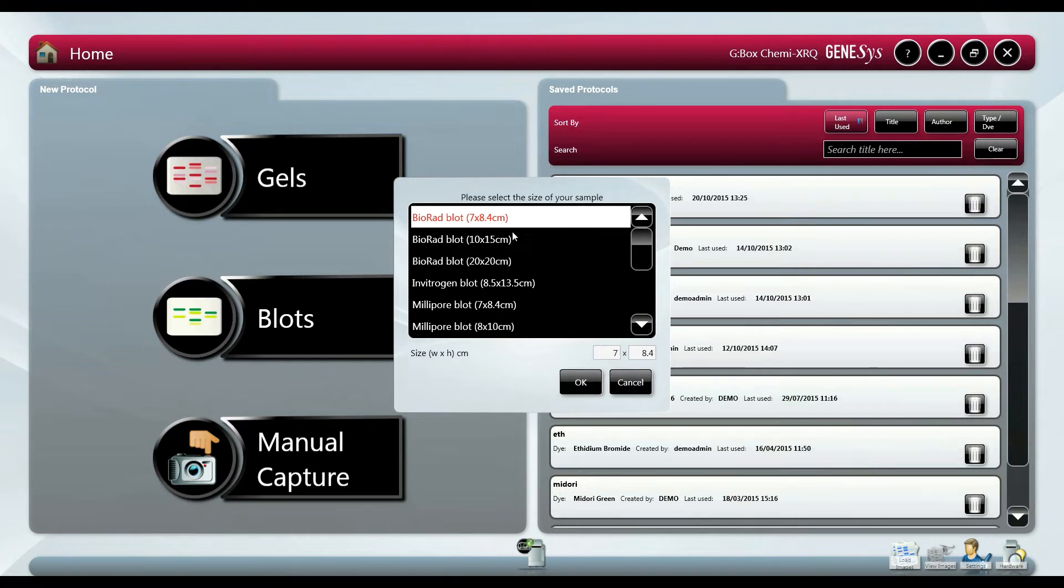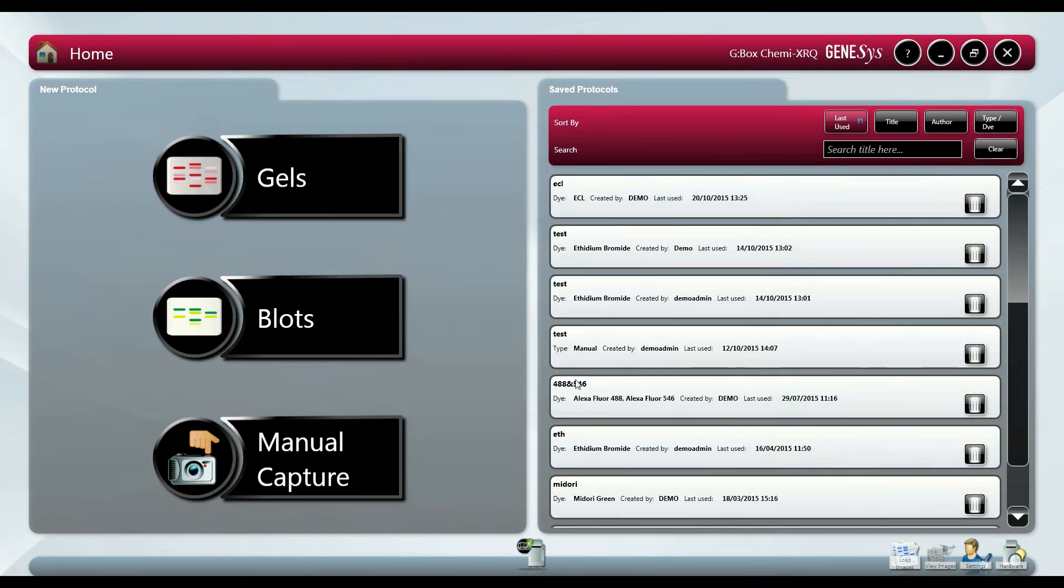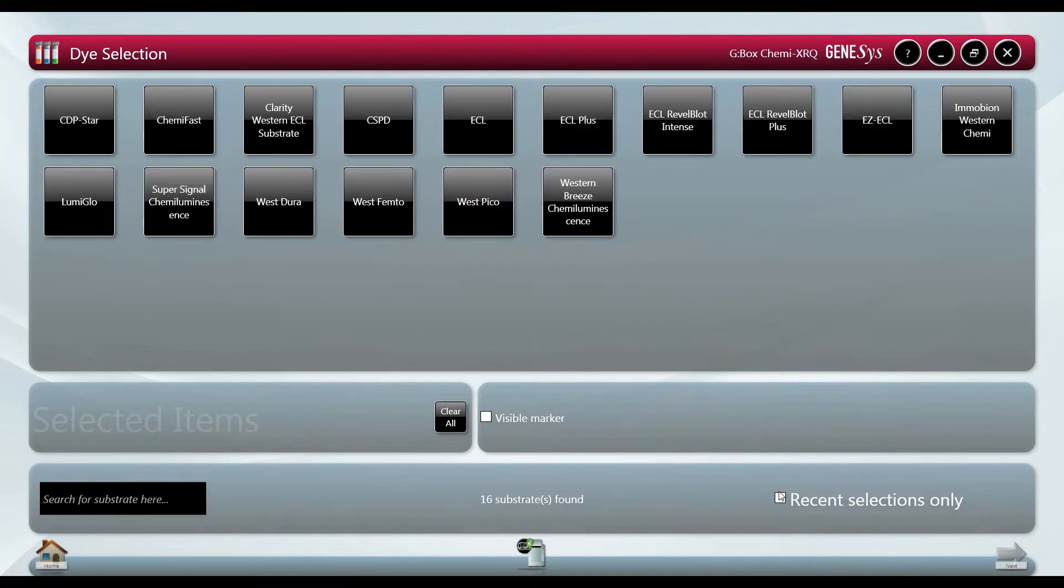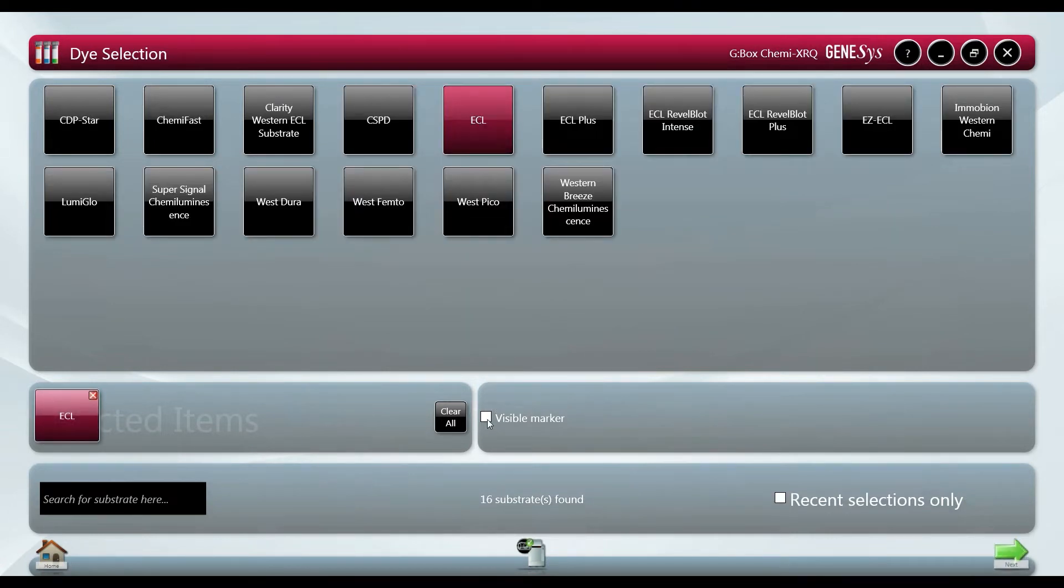We select the blot size to automatically zoom onto the sample for the best image resolution. The reagent used on the blots is then chosen so that when you refer back to the image later the protocol is saved.